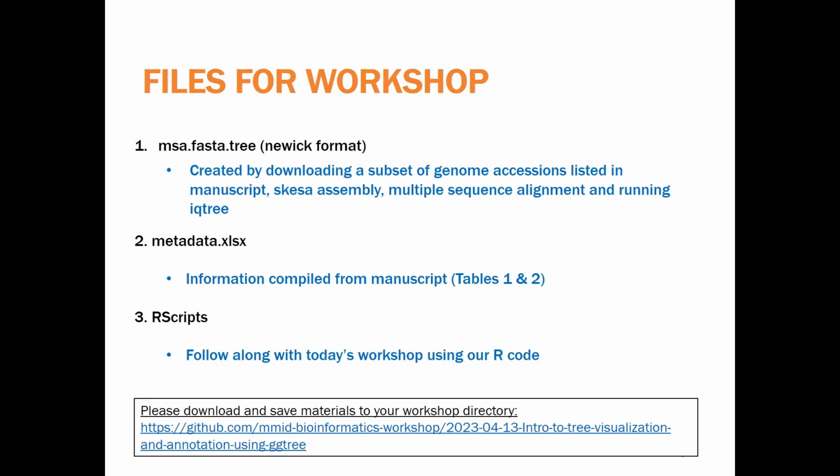There is one main script that you can open up and follow along for today's workshop, so you don't have to frantically type. It's kind of a lot to type for today. And then there's a second R script. Don't look at it yet. It is the answers to one of the exercises we're going to work through.